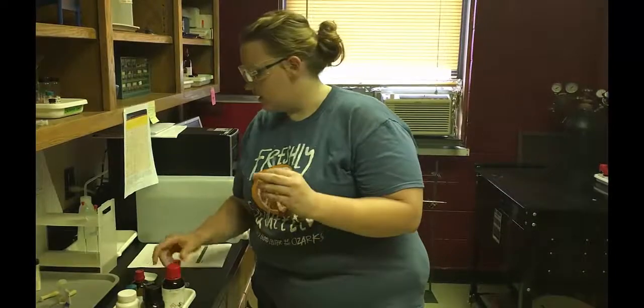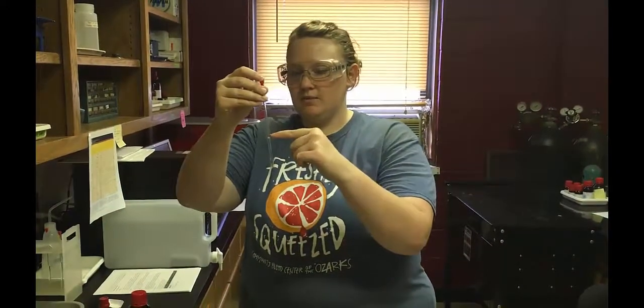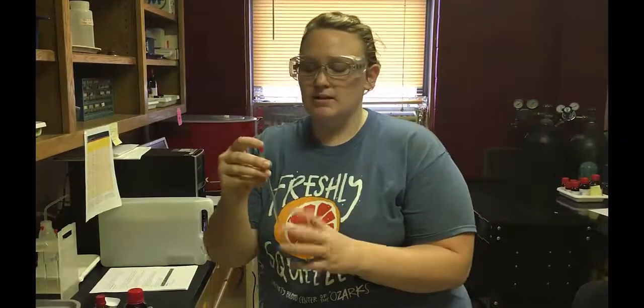Even if you're running an NMR on something that's already liquid, you still need about 0.7 milliliters, because that will bring the liquid line up to about here. And when you place it correctly in the machine, the magnets that are in the machine will be on either side of your solid and will get good spectra. Once you put it in your tube, you're going to invert it this way and back this way, and that will get all of the solid in your tube and dissolve it properly.